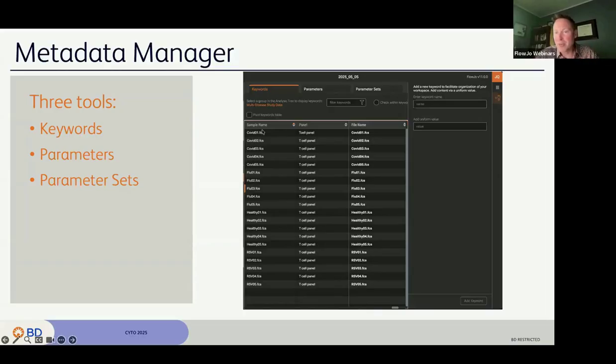So couldn't decide whether it was most useful to show a long list of all the samples and then a relatively compressed list of few keywords because you run out of room going to the right, or to hit the pivot and show all your keywords going down and a list of samples as rows. So click whichever one you want. That's another one that I guess at some point we'll add a preference for that. We haven't done that yet. That allows you to make it work as you want by default.